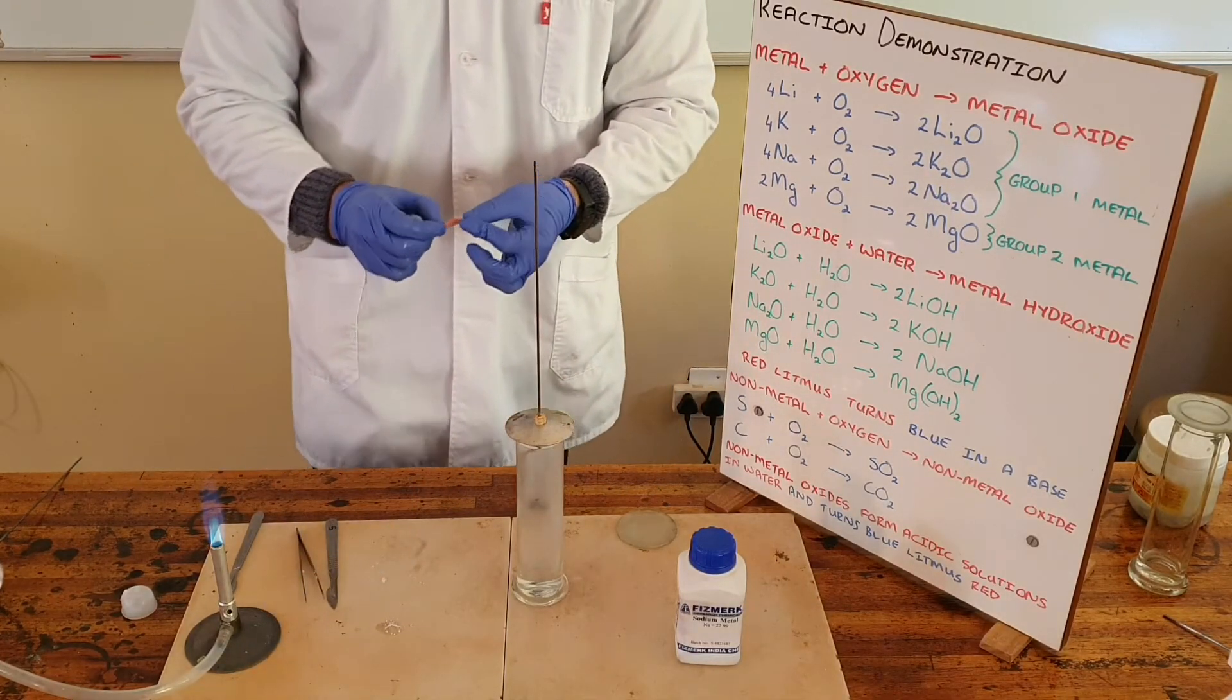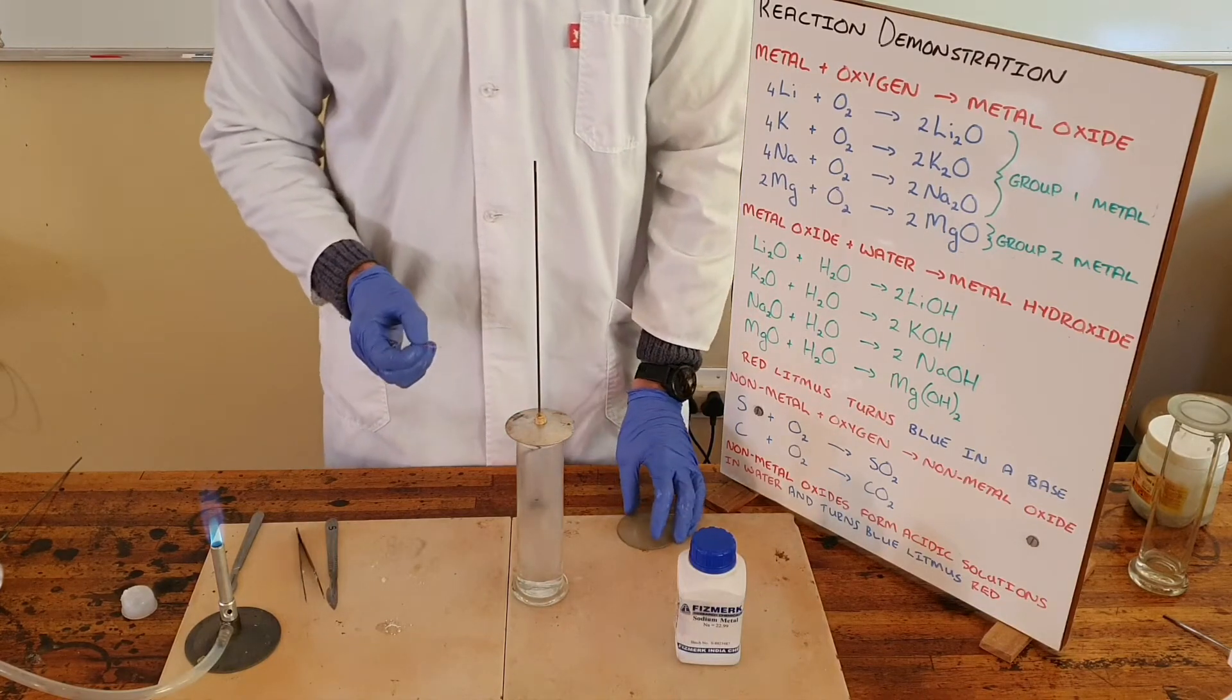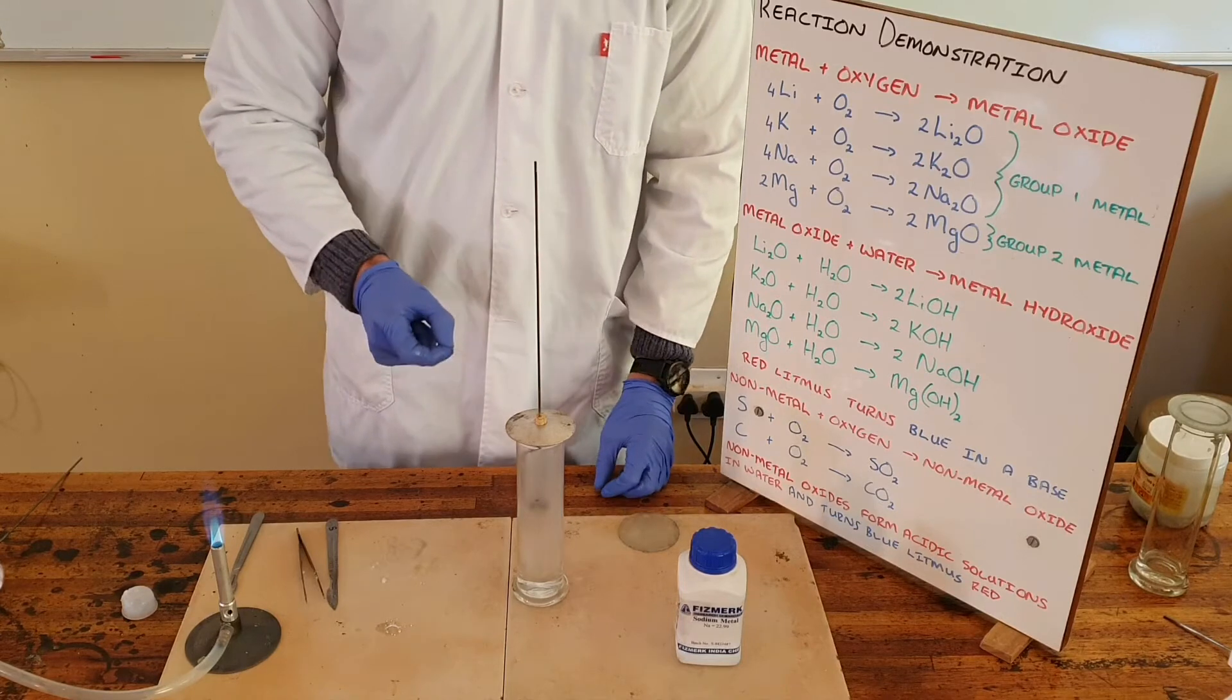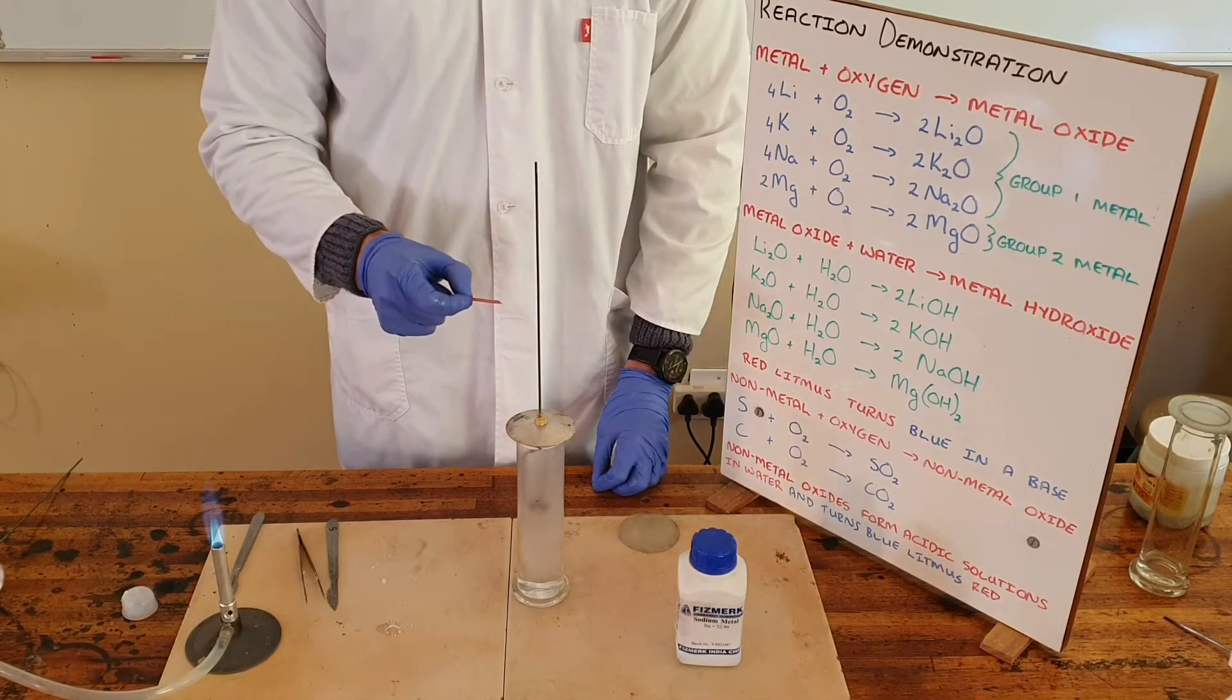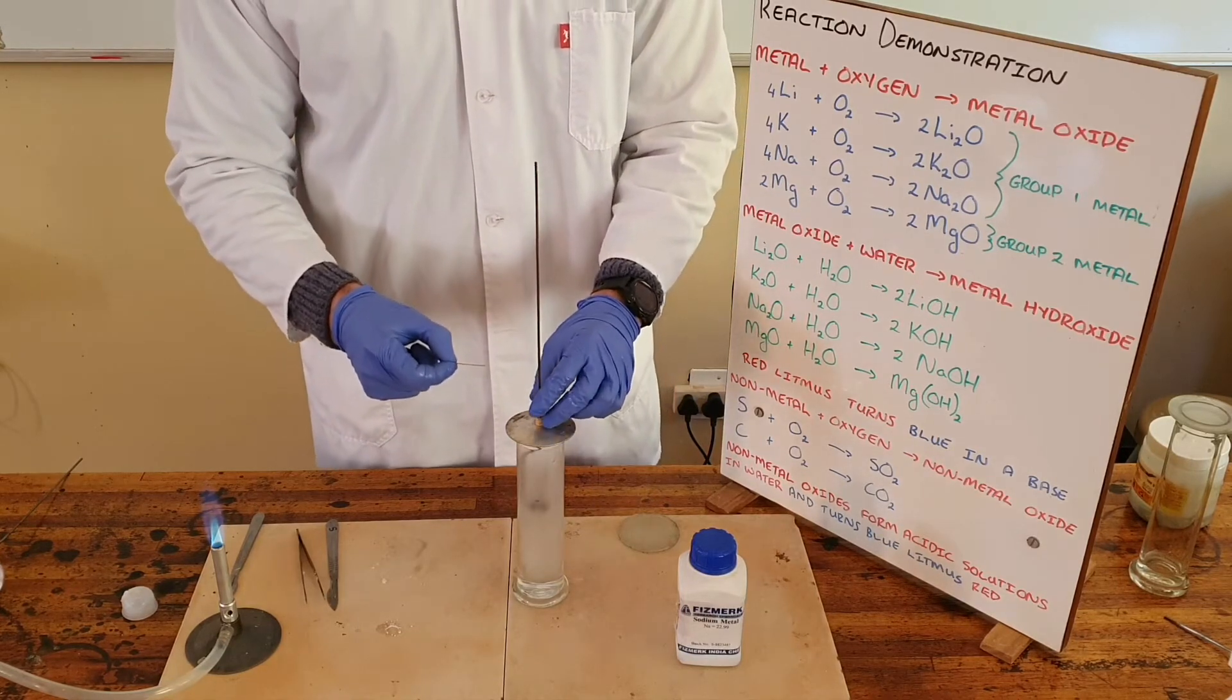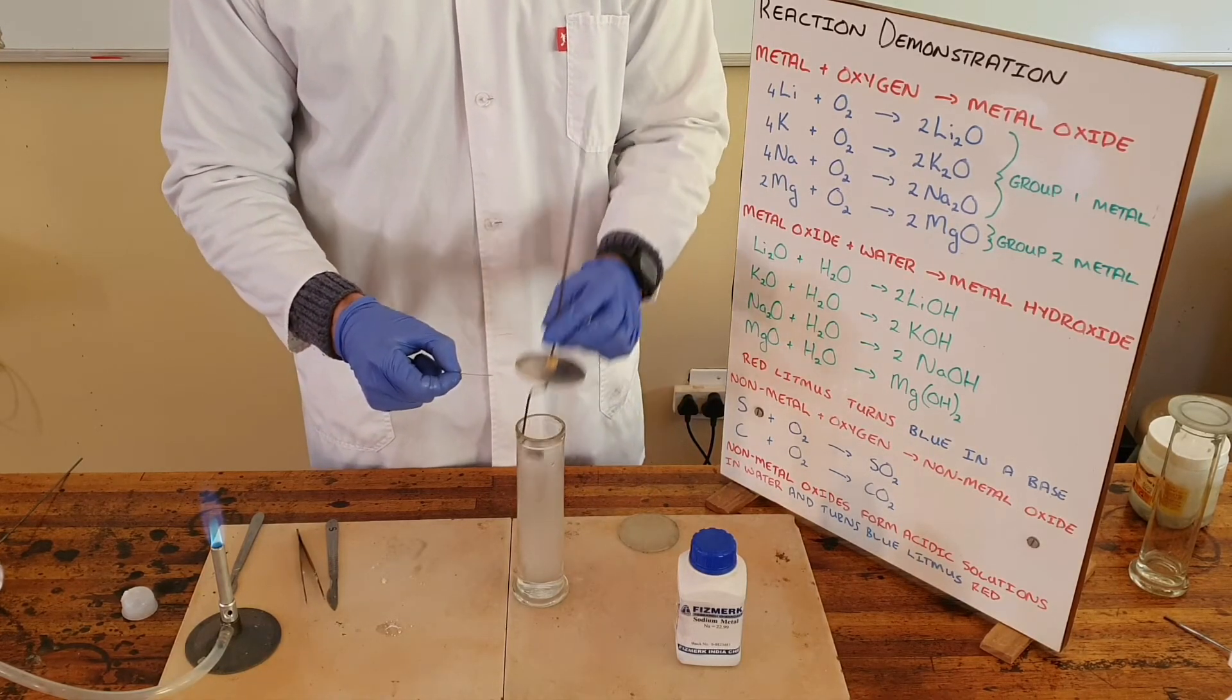This white smoke that forms is a product of the reaction, and that is now mixing with the water to form an alkaline solution. We can show that now.